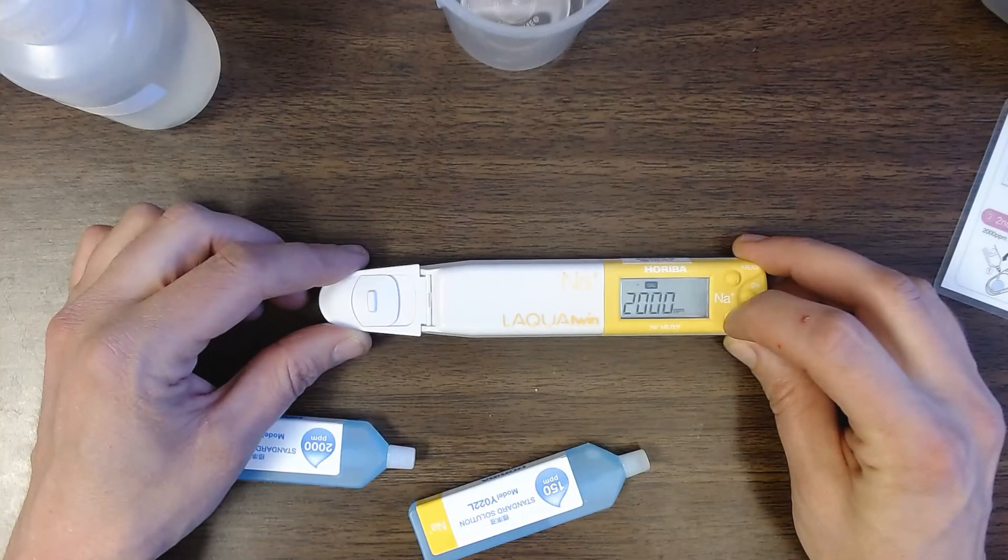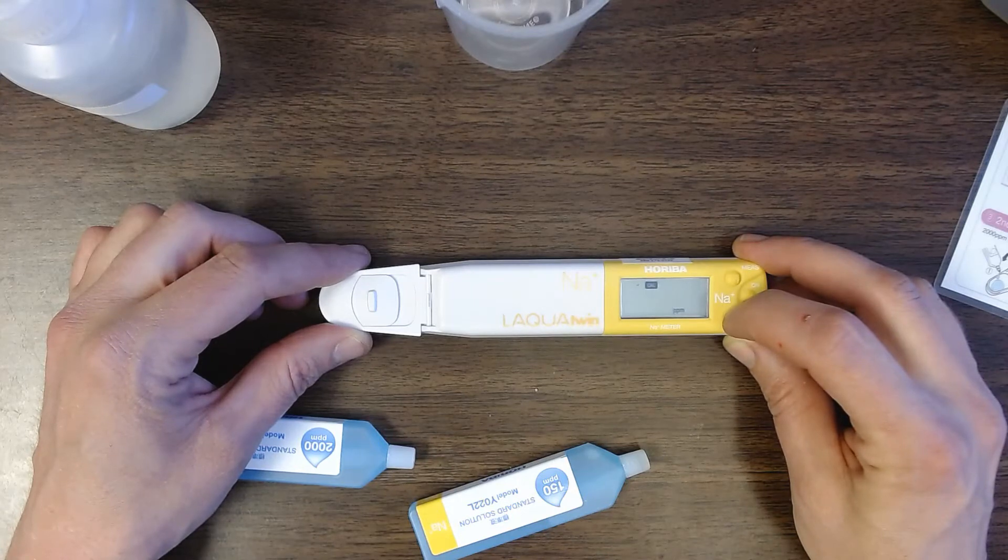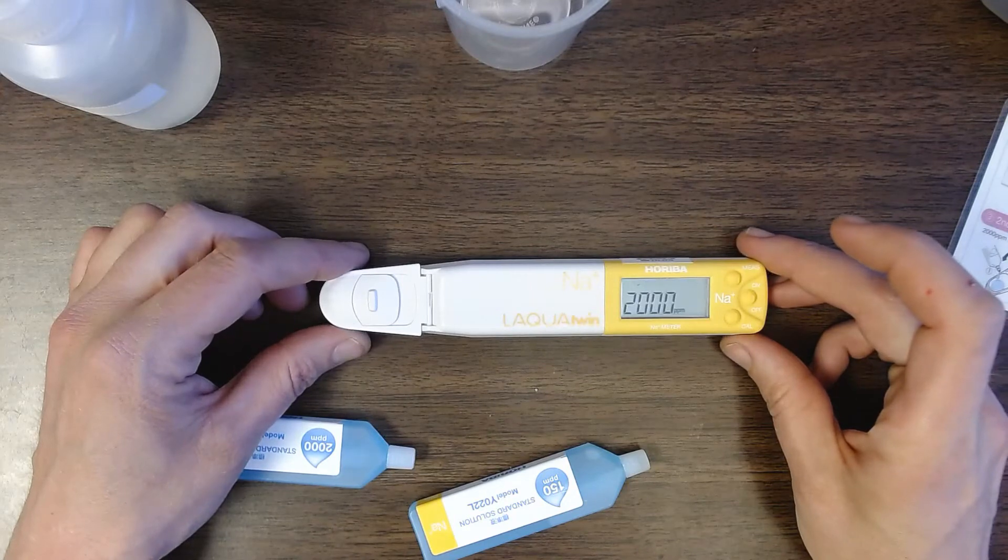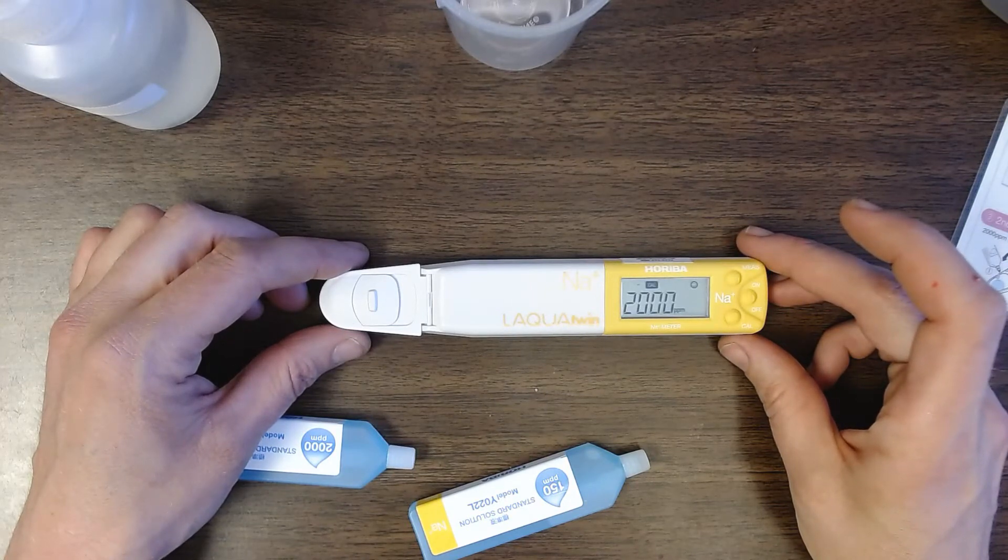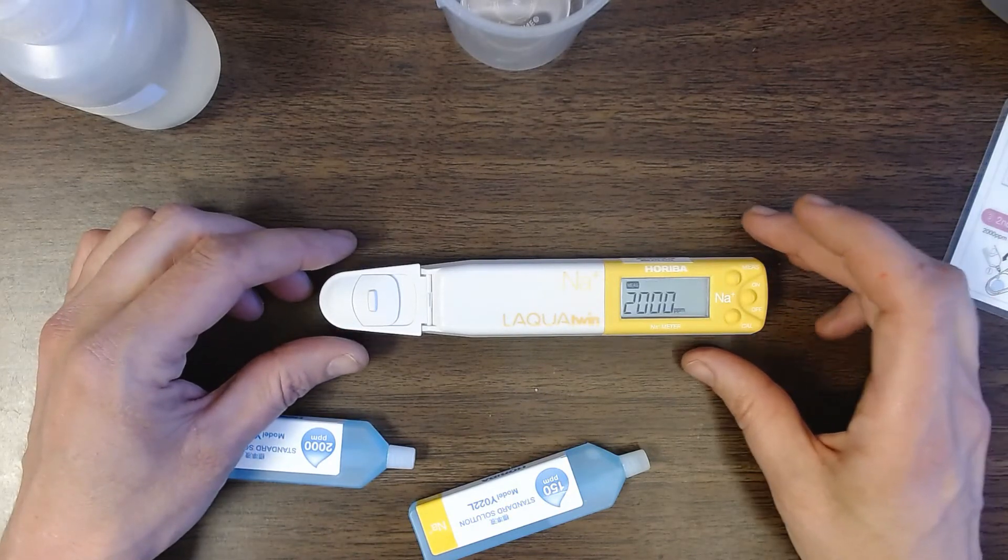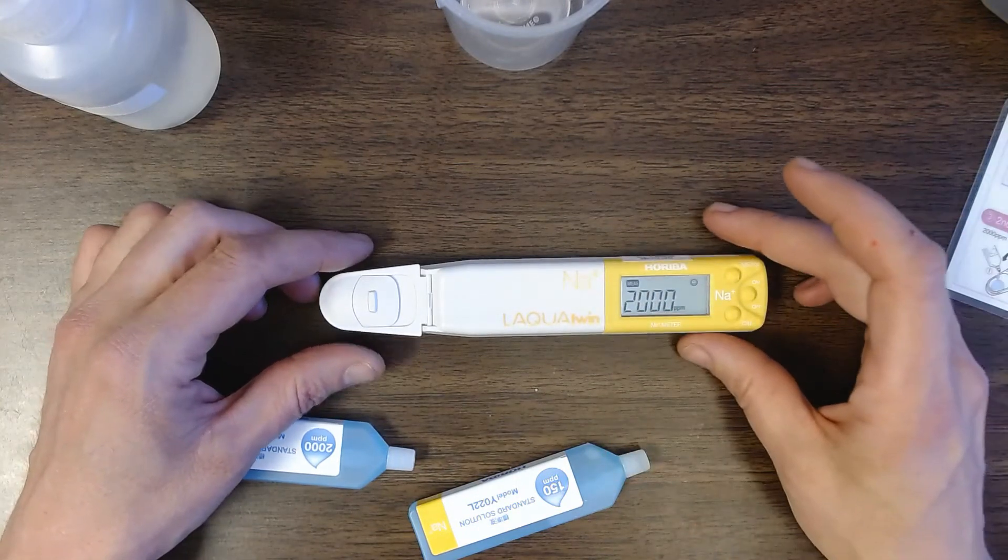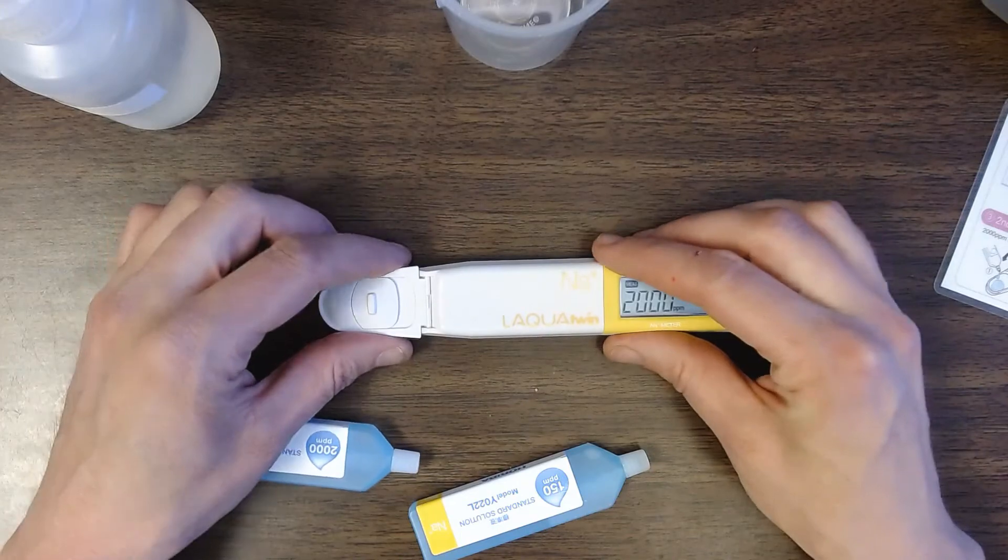And now it's flashing. It just wants me to verify do I mean 2,000? And I do. So I'll press again. And I'll wait. It's going to flash. It's got the happy sign. So it's happy. Calibrated 2,000 parts per million. And then it's just switched back now to measure mode. So it's ready to start measuring salinities.